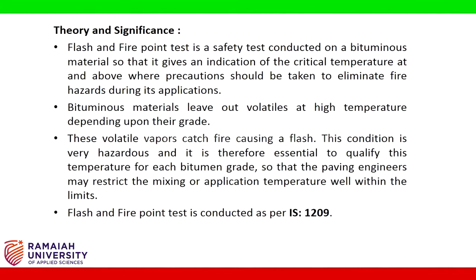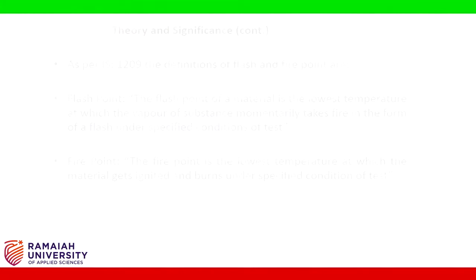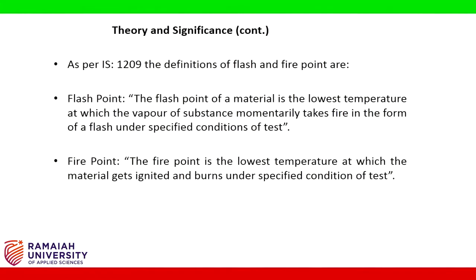Flash and fire point test is conducted as per IS 1209. As per IS 1209, the definitions of flash and fire point are: the flash point of a material is the lowest temperature at which the vapor of substance momentarily takes fire in the form of a flash under specified conditions of test. The fire point is the lowest temperature at which the material gets ignited and burns under specified conditions of test.